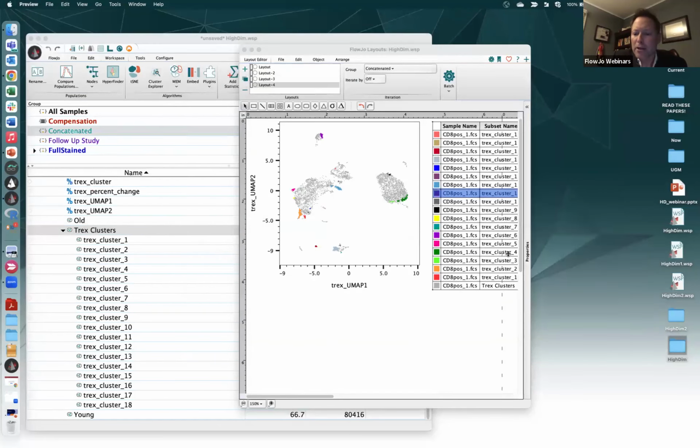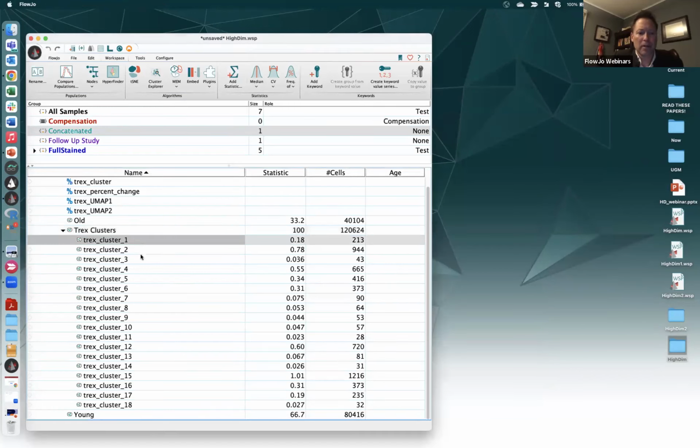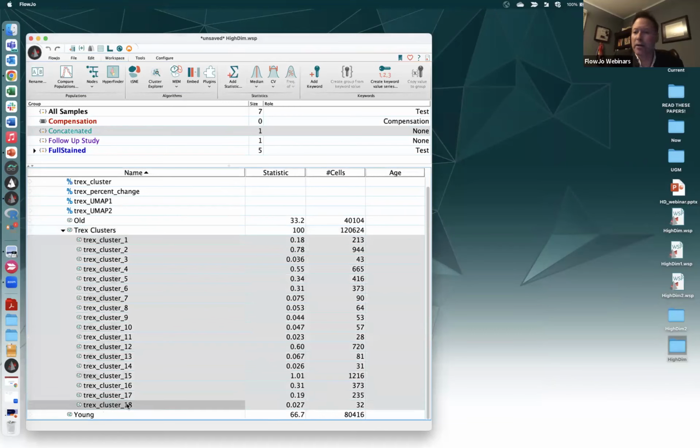Okay, so cool. Jumped right to where's the difference between our two perturbations. Awesome. Instead of doing any of those other steps I mentioned as a possibility, why don't we break out MEM? To do MEM, I just highlight the clusters that I want to get a MEM name. I go up to MEM and say, give me a MEM score.